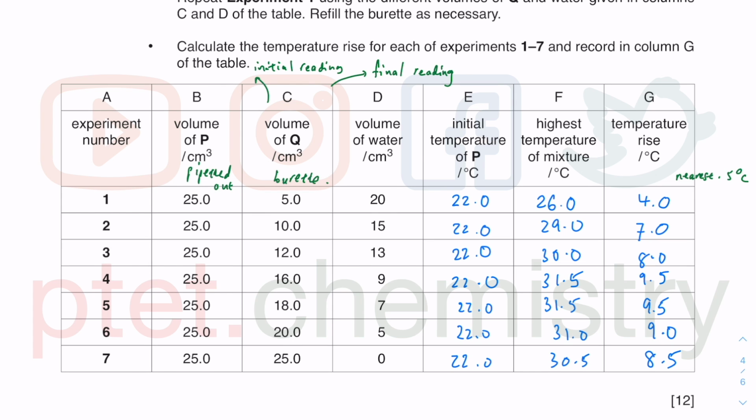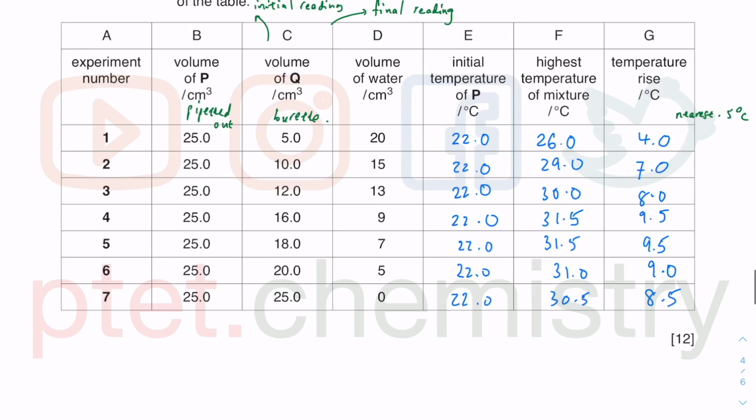So welcome back again, everyone. So we already got the experimental results from the experiment I just did. We can see the temperature rise. We have to express it to the nearest 0.5 degrees Celsius, as I mentioned, something 0.0, something 0.5. Your calculator will not tell you when it's 0.0. You need to keep an eye out for things like this. You need to be very careful.